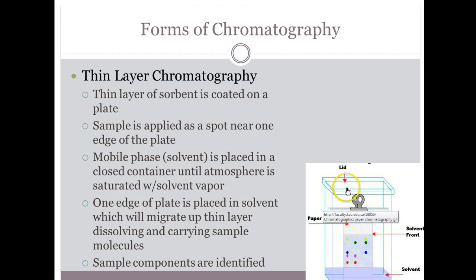So here's the picture. What we have at the bottom is a solvent. It's usually some type of organic solvent. And just like a Bounty tissue sucks up liquid, so does this paper that is hanging from this clip. So it will wick up that solution.